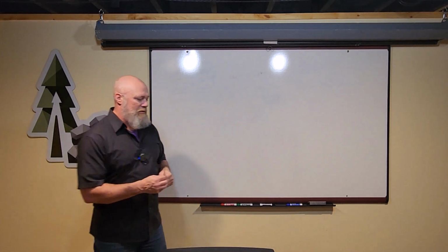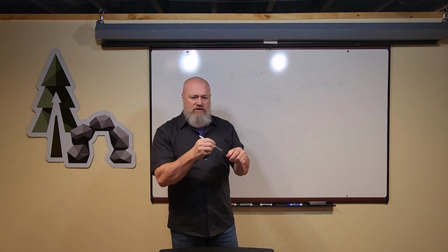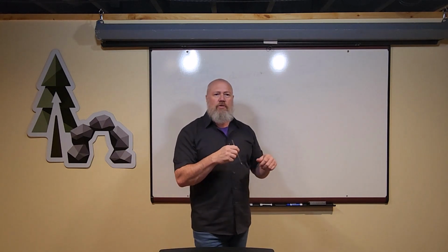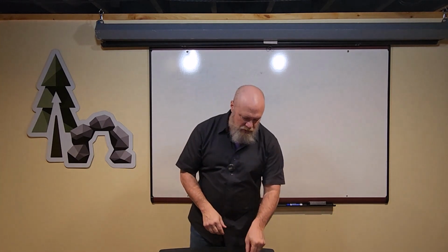That doesn't matter, you'll see them in the book. The blunt probe has a blunt end, it's slightly hooked, and it's set so you can tear through connective tissue and tease things apart like veins and other nerves and neurovascular structures. You can get in there and it'll help you pull them apart without ripping them. So the blunt probe is going to be your main dissecting tool, next to your fingers.